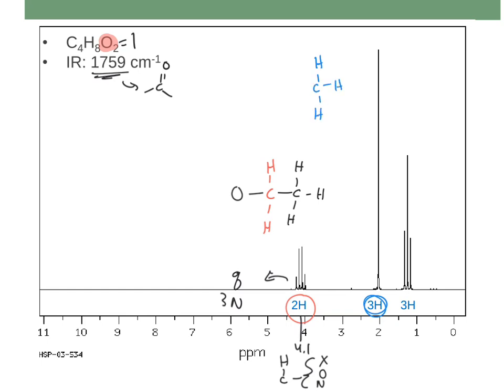And now if I look next to it, right, this is a singlet, which means it does not have any neighbors. Whatever is here, it does not have any neighbors. So the question is, what might it be attached to? Since this is showing up at, again, like 2.1-ish, that means we're talking about hydrogens on a carbon, and that carbon is double bonded to something, either a C or an O, right? Remember we said these are one away from an alkene or a carbonyl.